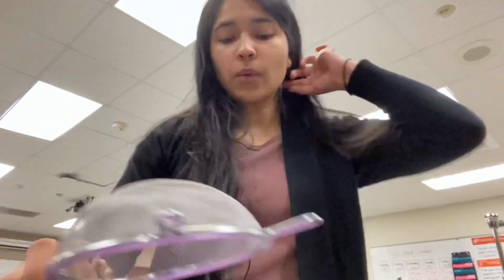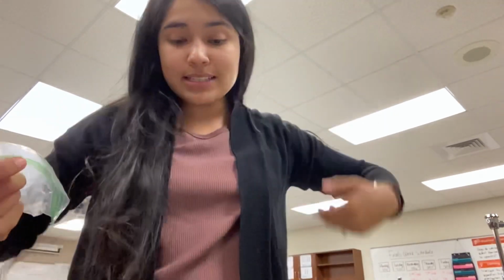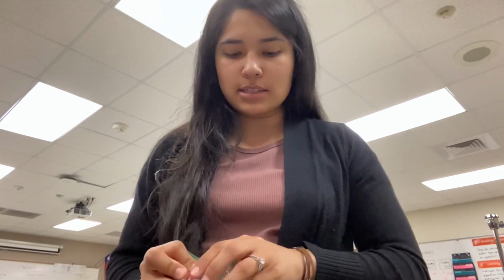Okay, so the next thing that I would do, because I understand that in here I have pepper, sand, and ionic compounds still left over, is use a magnet to separate the iron filings, because that would probably be the easiest thing. If I start doing anything else, the iron is still going to be there and just in the way. So I'm going to take my magnet.